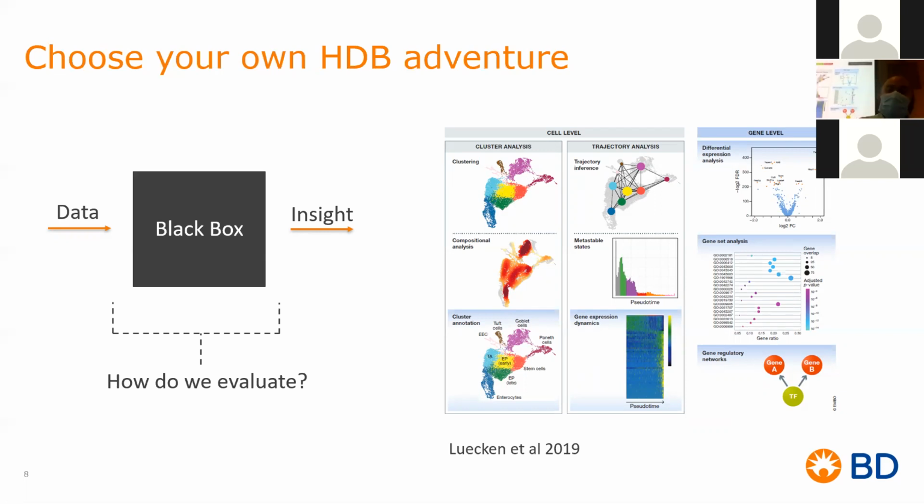Do you want to analyze this via a t-SNE or a TriMap, looking at either the local or the global architecture? Do you want to do this by traditional means, looking at traditional gating? Or do you want to do basic trajectory analysis, etc.? It's up to you. And that's kind of what I'm putting on the figure on the right.